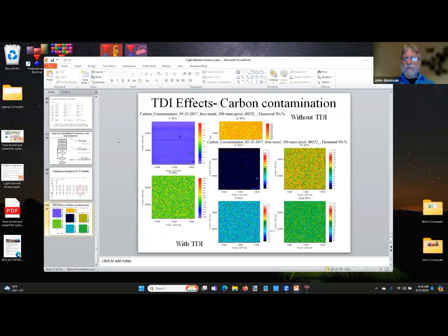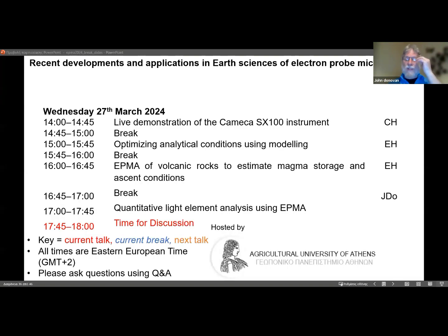So what you want to do is, you have two spectrometers. Imagine that you've taken those two spectrometers and those crystals and made them into a giant crystal that's twice as big. All you're really doing is increasing the geometric efficiency. And as we all know from EDS, the larger the EDS detector, the better sensitivity we get, right? So we can do the same thing with WDS. We basically analyze the same element on two spectrometers, or 3 or 4 or 5.